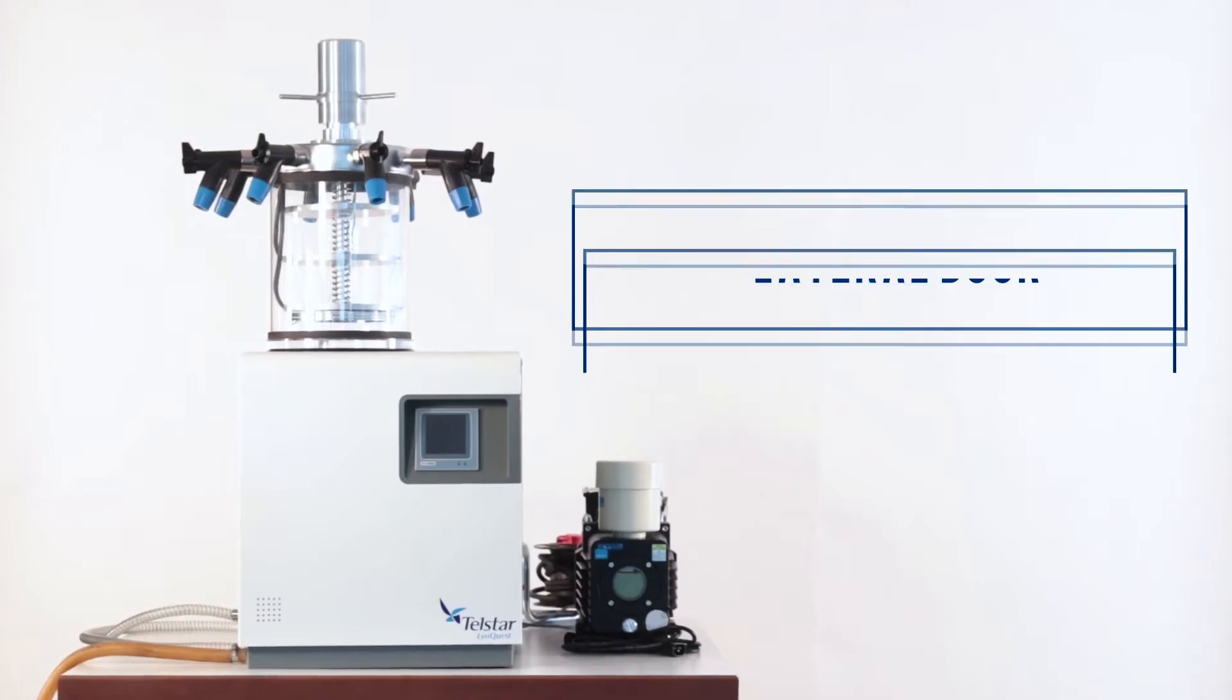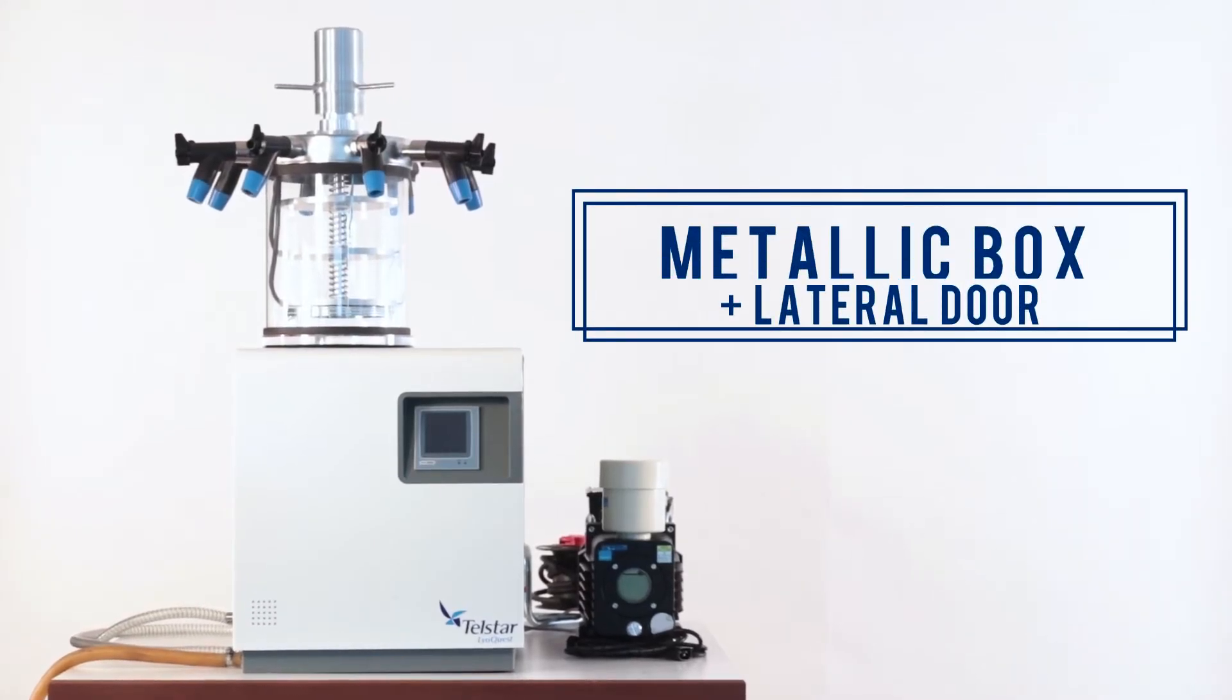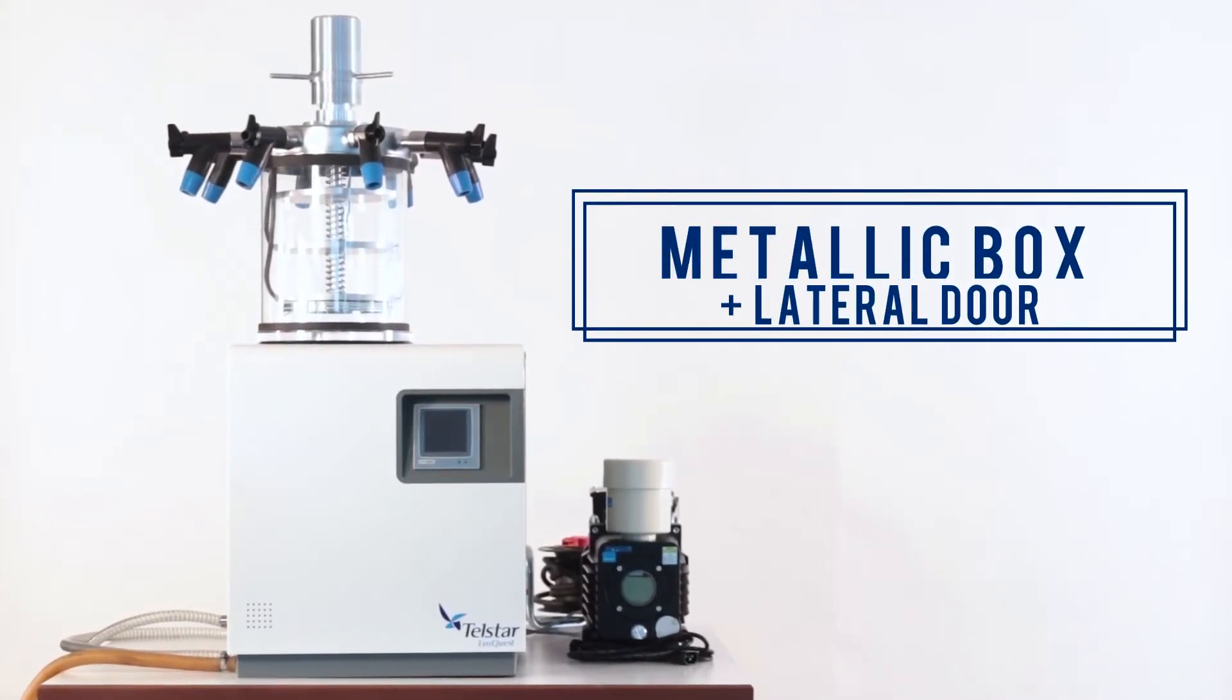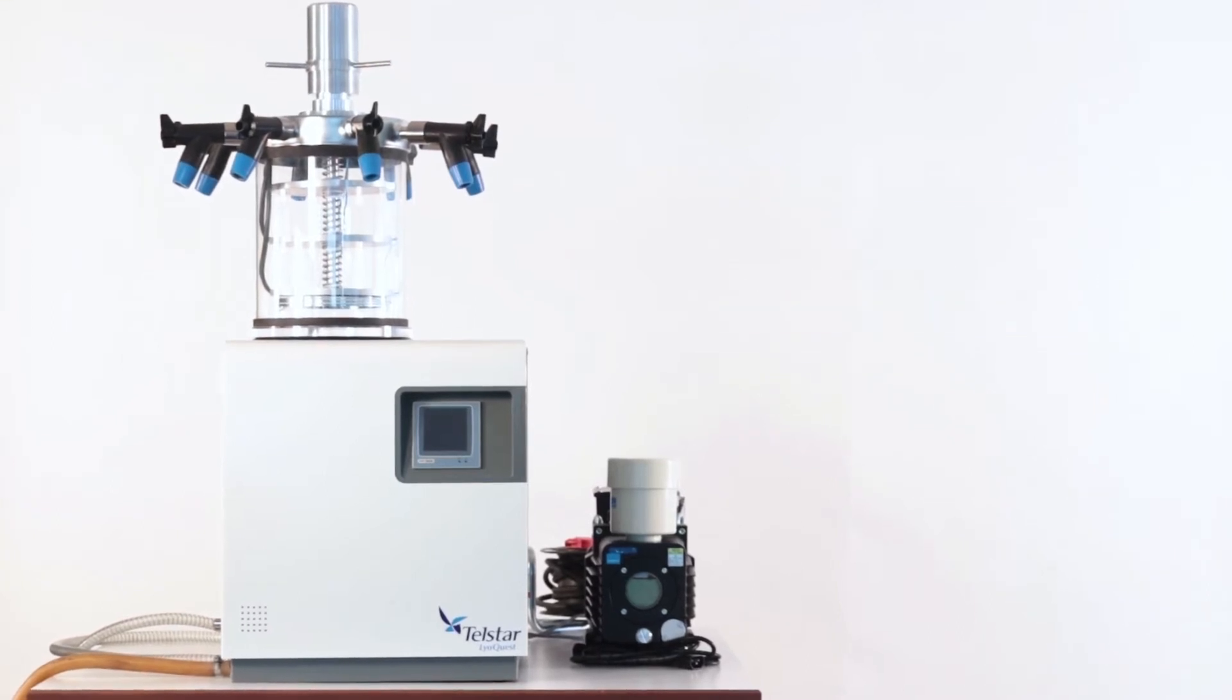The LyoQuest freeze dryer is built as a compact desktop version. The basic unit consists of a metallic box with lateral access door to perform maintenance tasks.